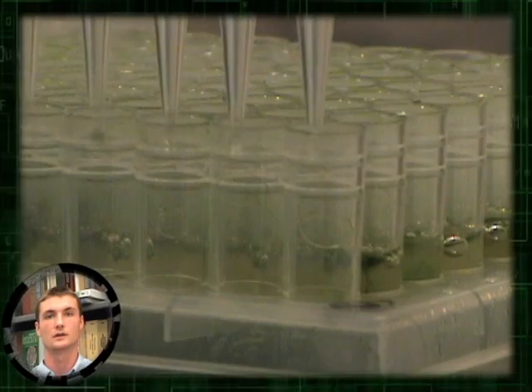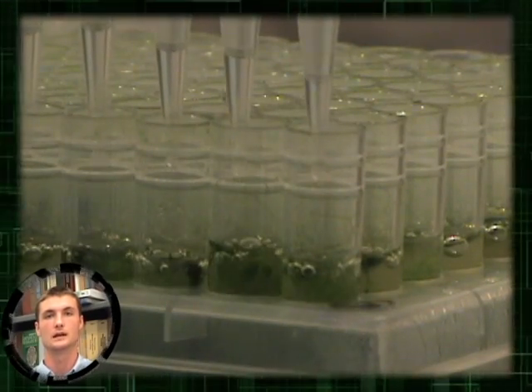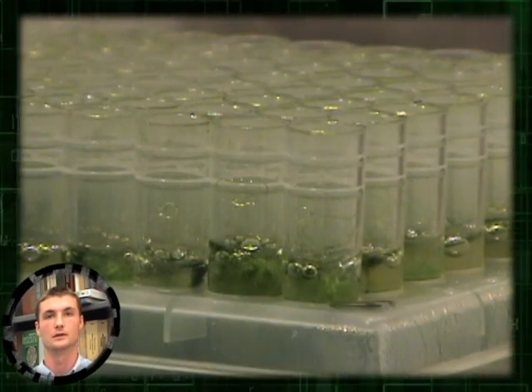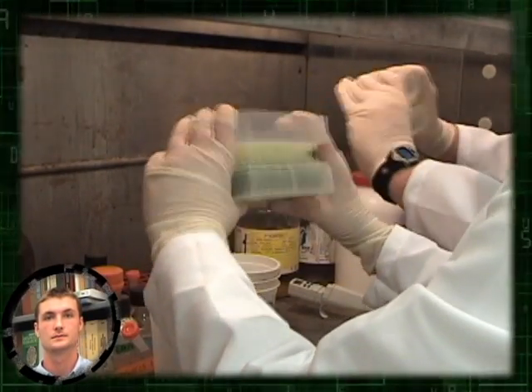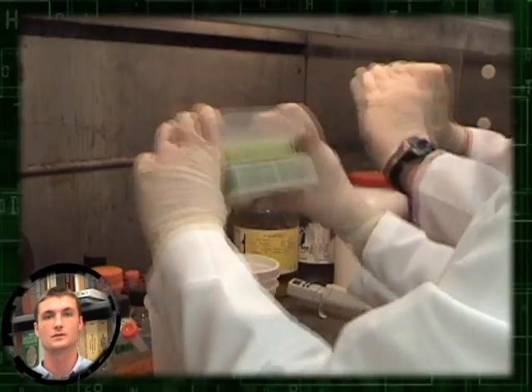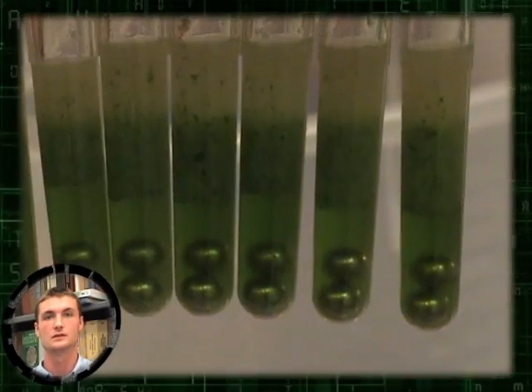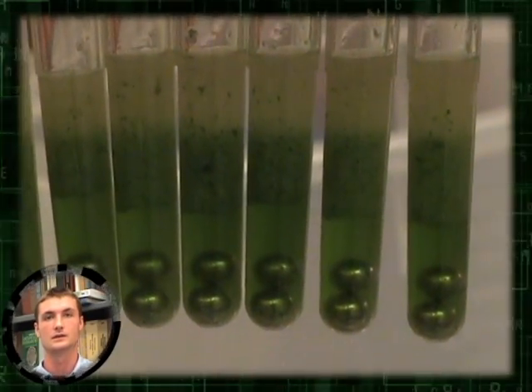An organic solvent chloroform is added to denature proteins and help remove the lipids. The tubes are then mixed well and then centrifuged to separate the organic and aqueous phases.